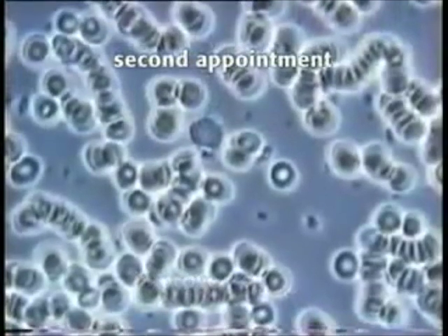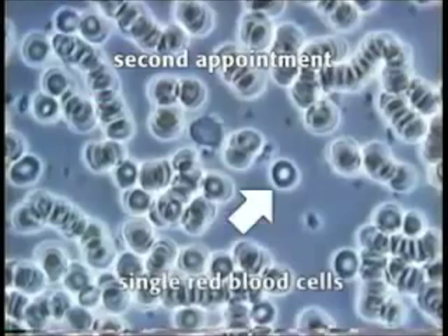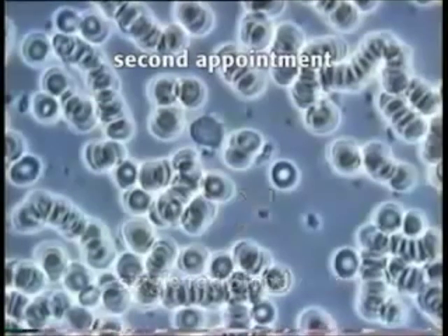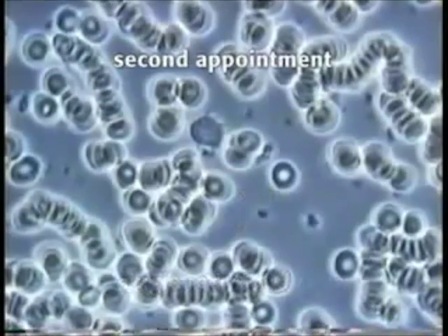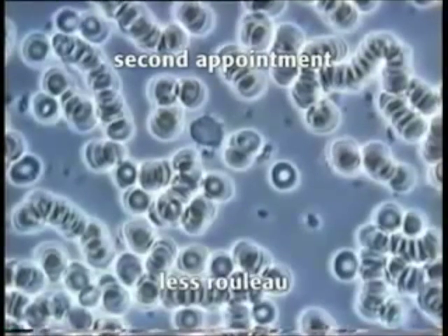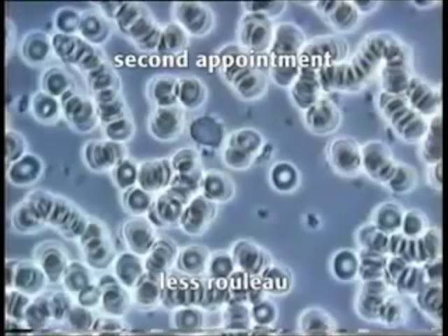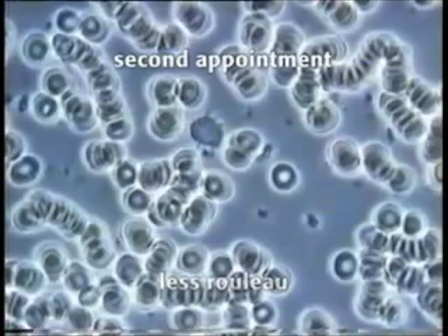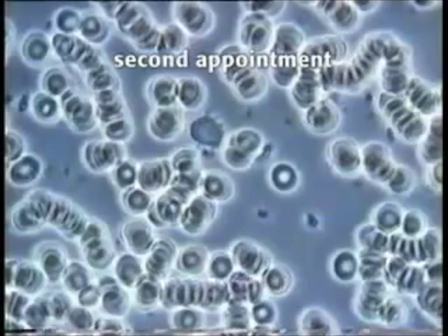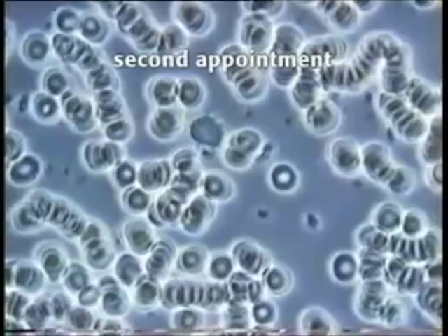As you can see in the sample, there are more single red blood cells. The red blood cells are more even in size and shape. There is less rouleauing and the blood sample is more open. The chains of rouleaus are less sticky. There are small clumps of cells, but the blood is nowhere near as heavily clumped and rouleaued as it was on the first visit.